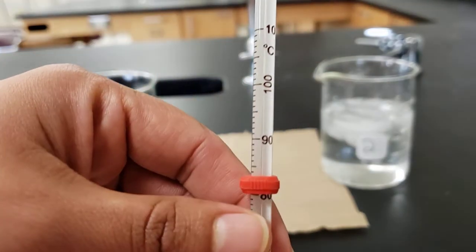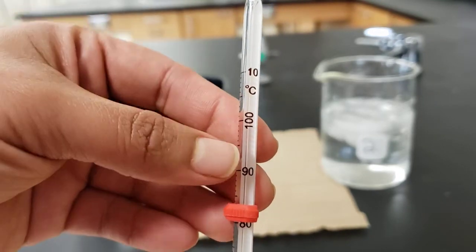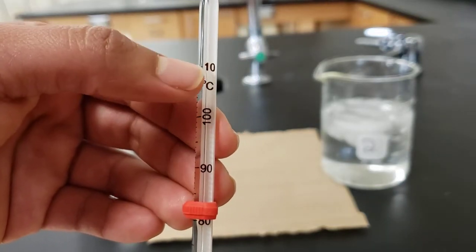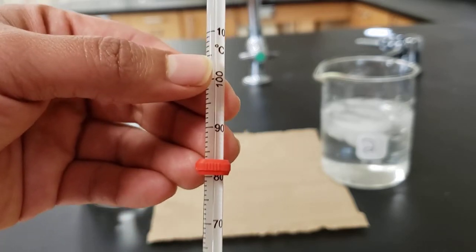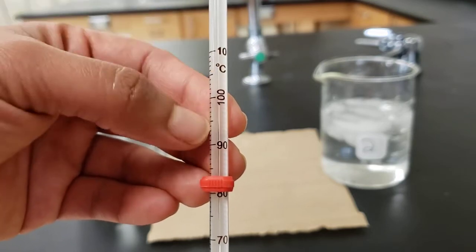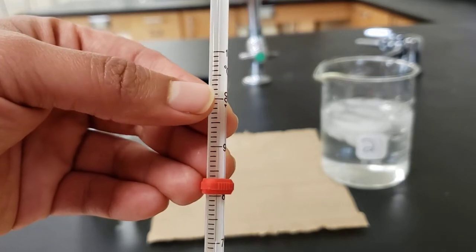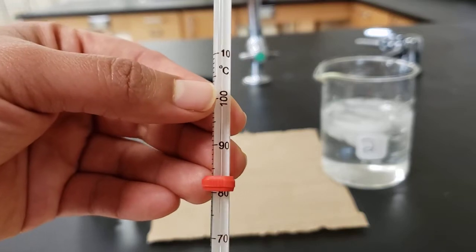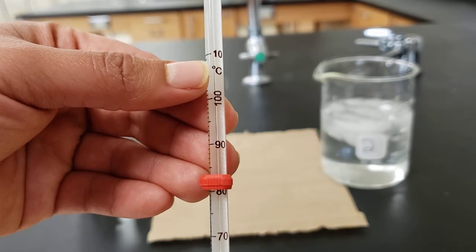If we go all the way up here at the top, we can actually see the symbol for Celsius. This particular thermometer goes all the way up to 110. This 10 actually means 100 plus 10. Because of this limitation, you cannot read any temperatures really above boiling. This is boiling for Celsius. Also notice that you cannot read any decimal temperatures. So on the lab for this one, you may put a whole number for temperature because these thermometers only read in whole numbers.